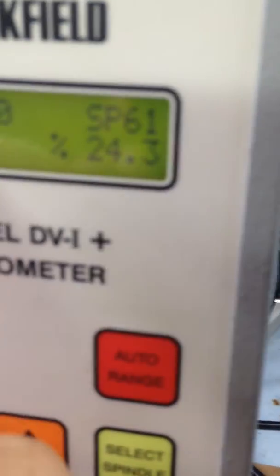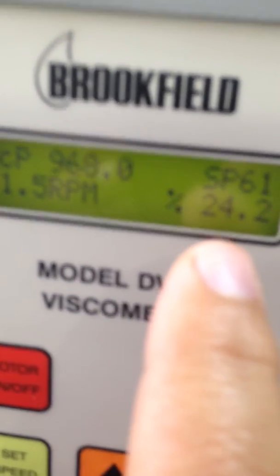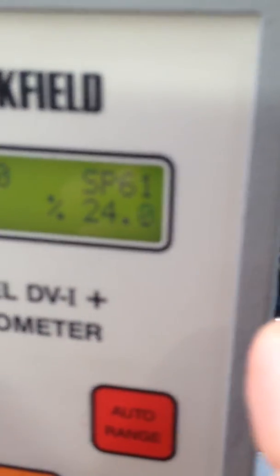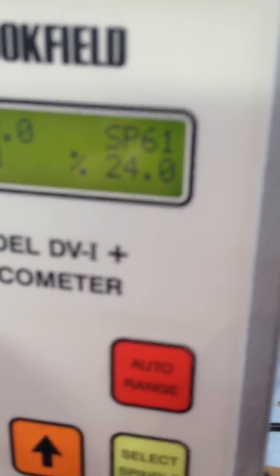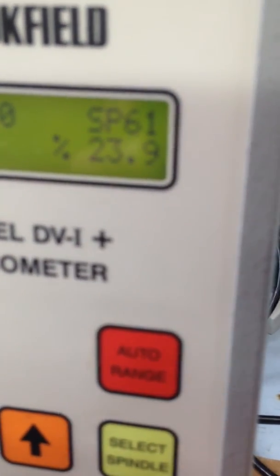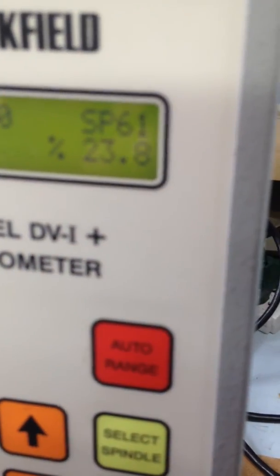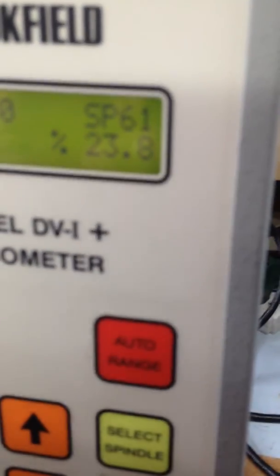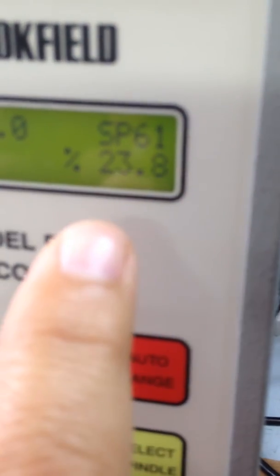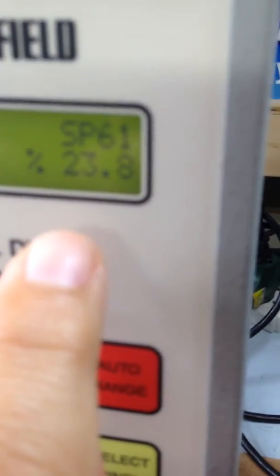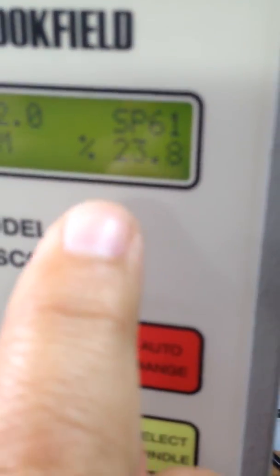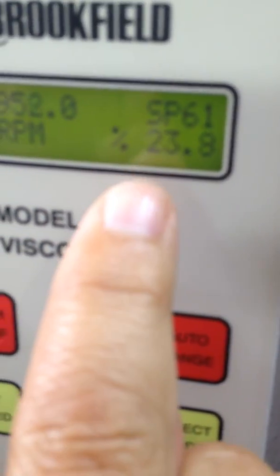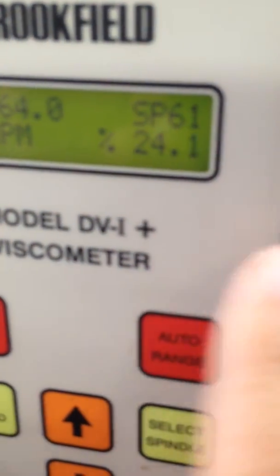It means that it's now at 972 centipoise. The instrument is putting a shear on the spindle and its range is 23 percent. It means you're not in the middle range, you're actually one quarter of its strength. You're actually one quarter of its strength, it can actually go way up.